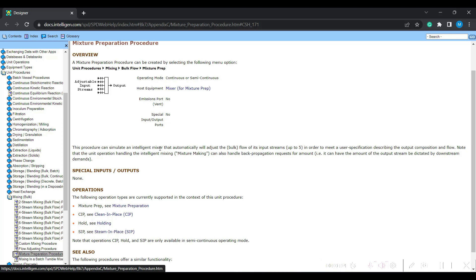What this mixture preparation procedure does is simulate an intelligent mixer that automatically adjusts the bulk flow of its input streams to meet a user specification describing the output composition and flow. Whenever you have multiple components and need a defined composition, you can use this mixture preparation procedure — typically employed in media preparation.